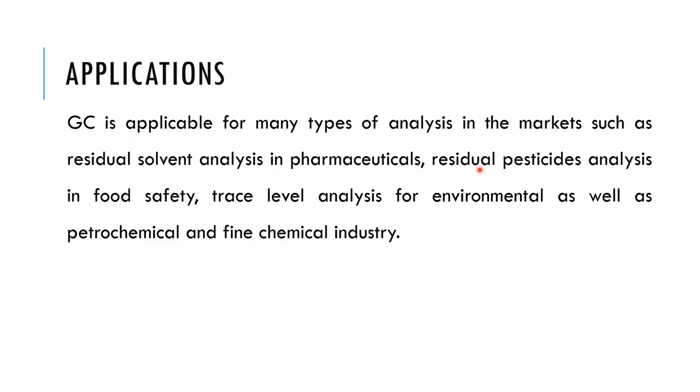the products which are present in the sample. Similarly, in pesticide analysis, recently we would have got to know about this Maggi. We have more amount of pesticides in the Maggi. It means it's not pesticides, it's an impurity which they had not ensured to test and remove during the release of a certain batch. So this batch has a certain higher amount of the impurities present in the food. So there were some issues. They were asked to take back the samples and also analyze and quantify them on a different instrument.